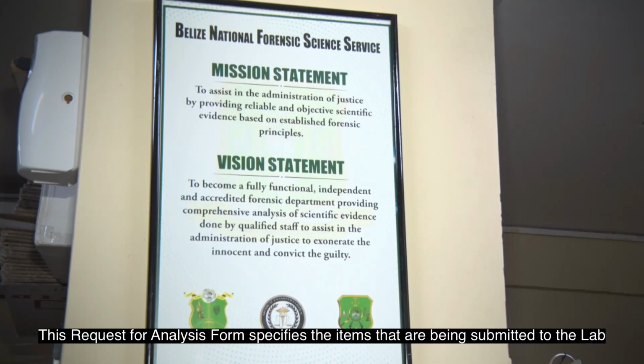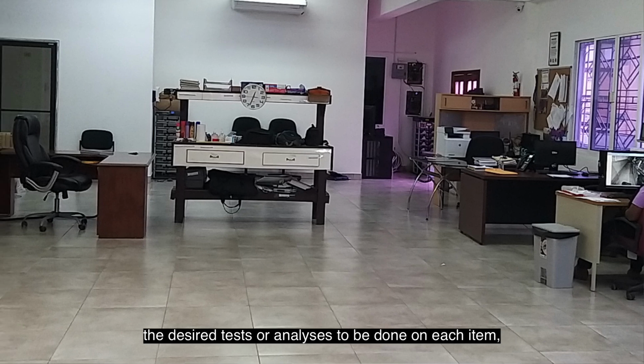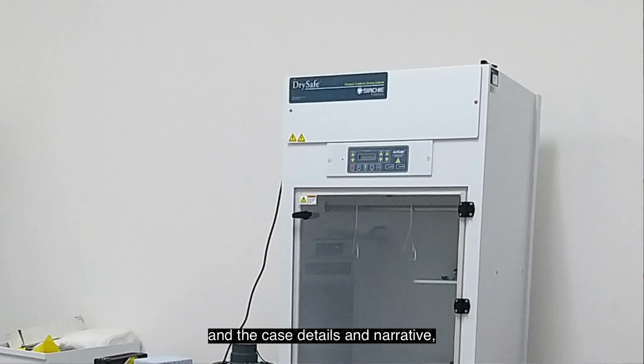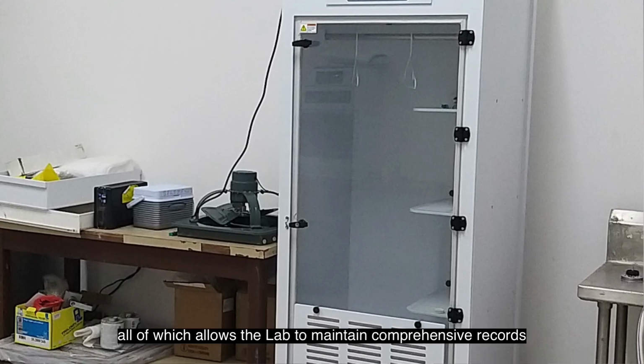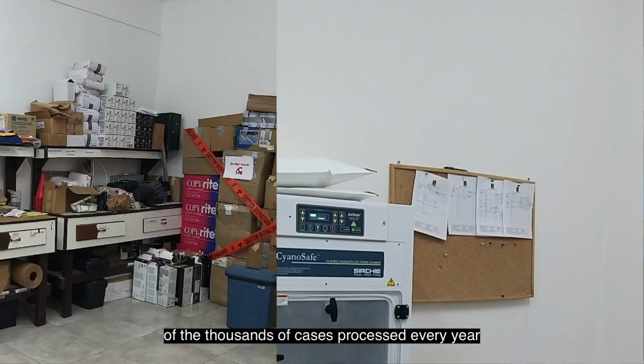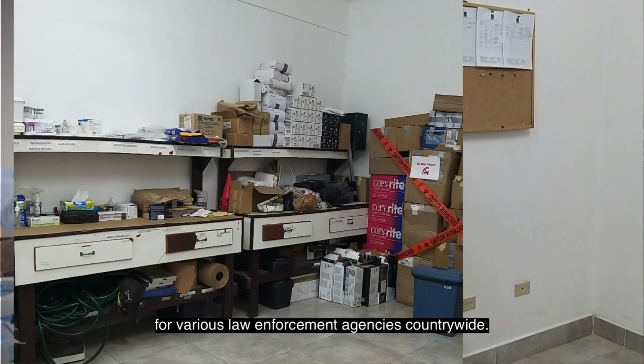This request for analysis form specifies the items that are being submitted to the lab, the desired tests or analyses to be done on each item, and the case details and narrative, all of which allows the lab to maintain comprehensive records of the thousands of cases processed every year for various law enforcement agencies countrywide.